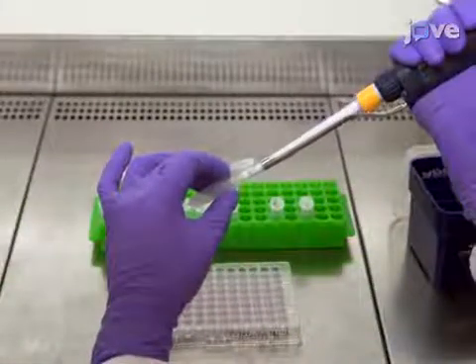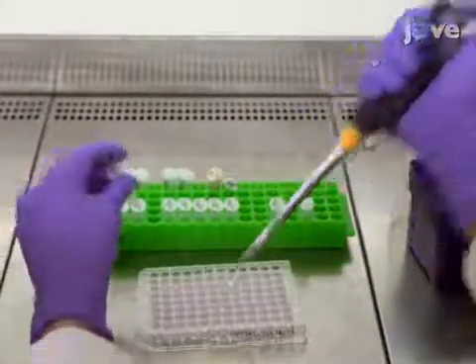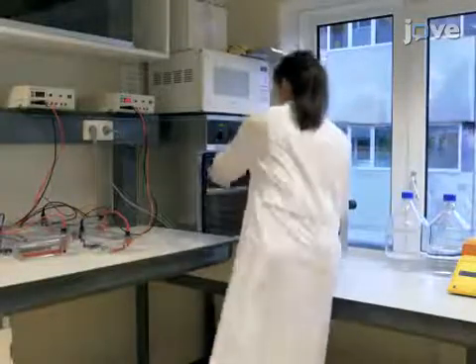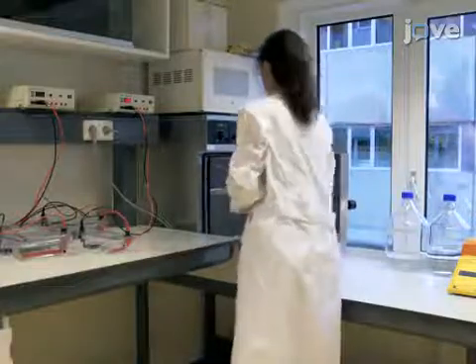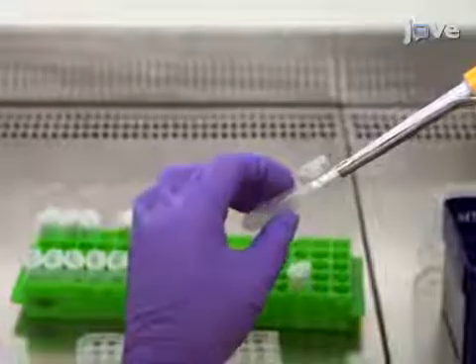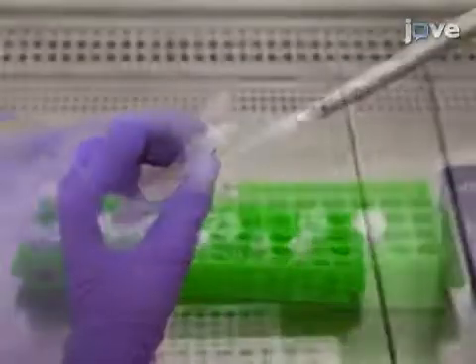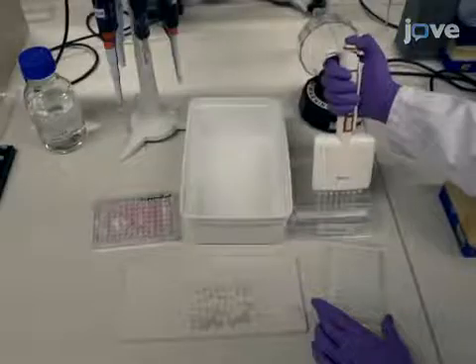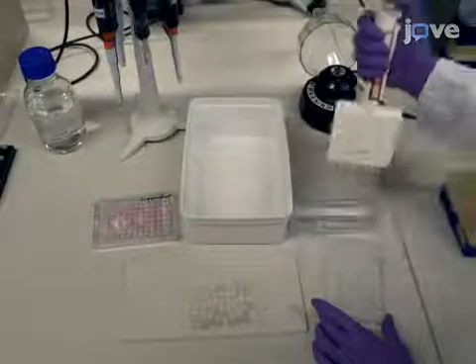Apply 50 microliters of the supernatant or standard to each well, and incubate the ELISA plate for an hour at 37 degrees Celsius. In the same manner, additional ELISAs can be set up to analyze further dilutions of the supernatants to test the antibody affinity. After the incubation, wash the plate.